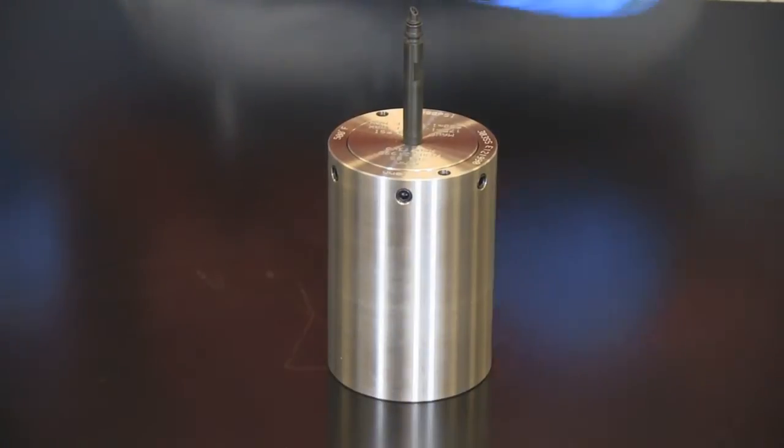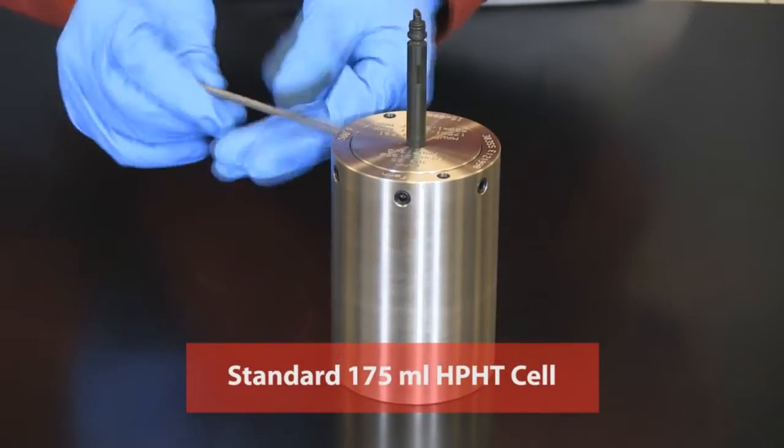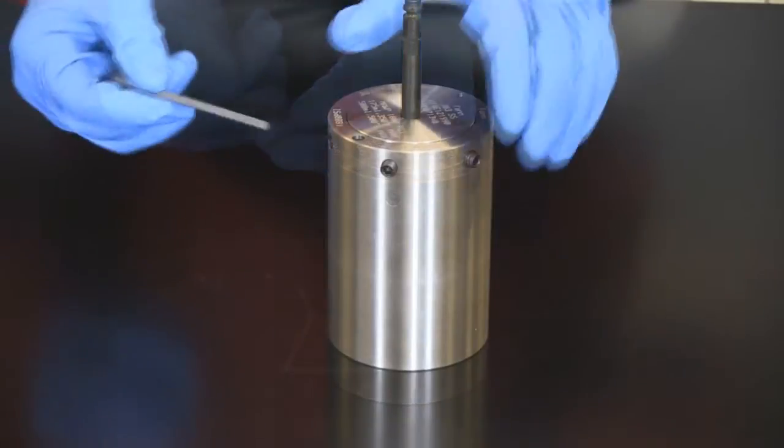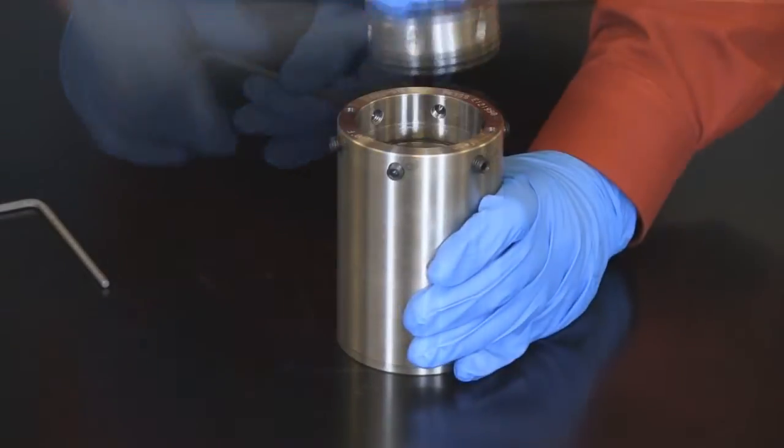This is the standard 175 milliliter high-pressure, high-temperature cell used today. Six hex screws secure the cap to the body while under pressure. A filtrate screen is integrated into the bottom of the cap.